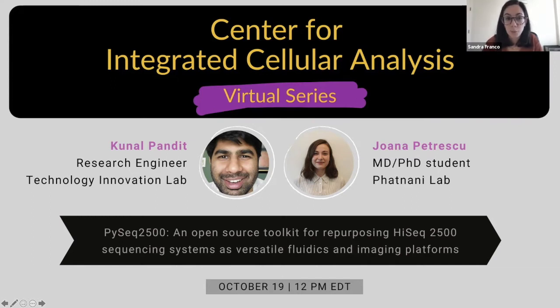Today, we have two speakers that have worked together to repurpose and validate a piece of equipment that most of you will be familiar with, the HiSeq2500 instrument, and turn it into a versatile fluidics and imaging platform. As usual, there's going to be time at the end of their presentation for you to ask questions, and you can do so by either raising your hand or typing your question in the chat box.